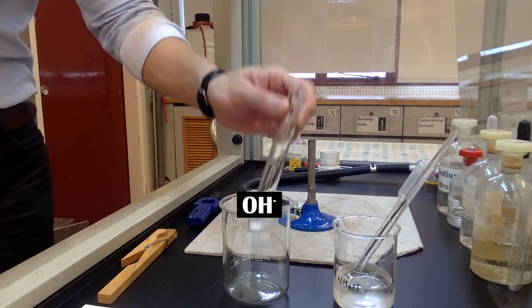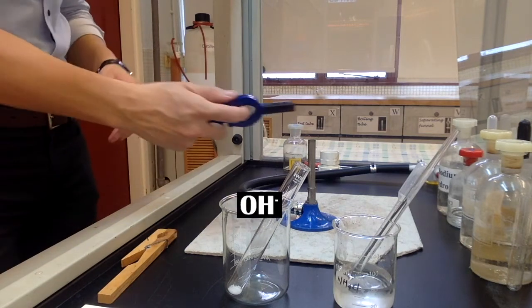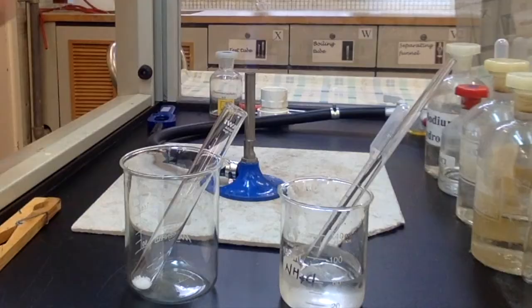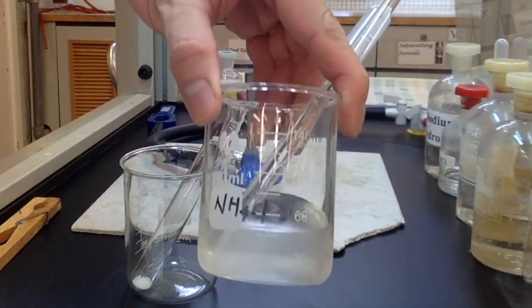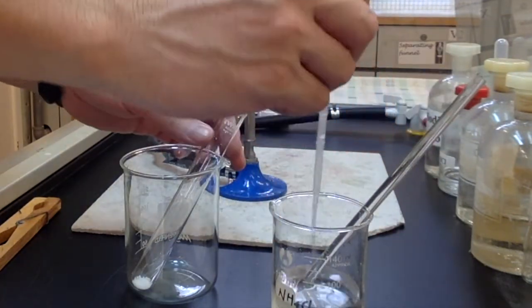Solid sample containing hydroxide ion is prepared. Add dilute ammonium chloride solution into the solid.